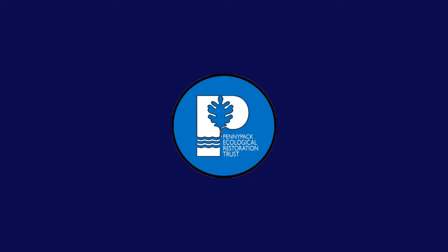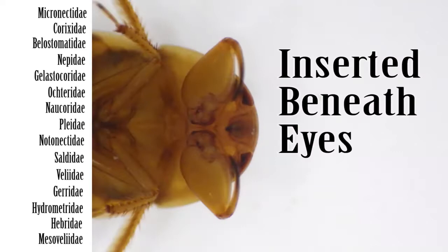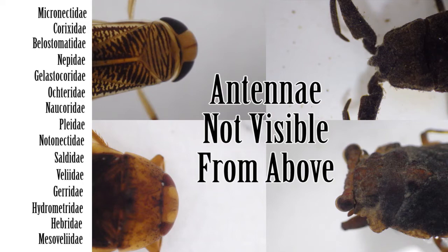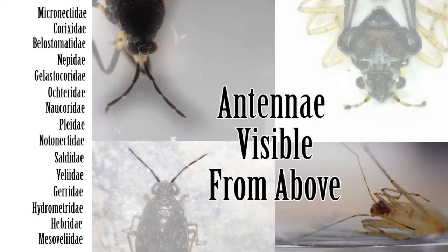I'm Nick Misalko, and today we'll be keying out the families in the order Hemiptera. Step 1: First check the antennae. If the antennae are shorter than the head and inserted beneath the eyes, then move on to Step 2. Generally, these forms of antennae will not be visible from the dorsal view. If the antennae are longer than the head and inserted in front of the eyes, then move on to Step 11. These antennae are always visible from the dorsal view.